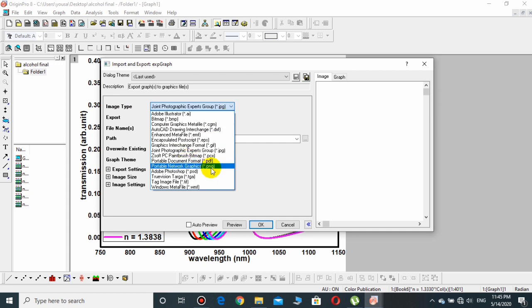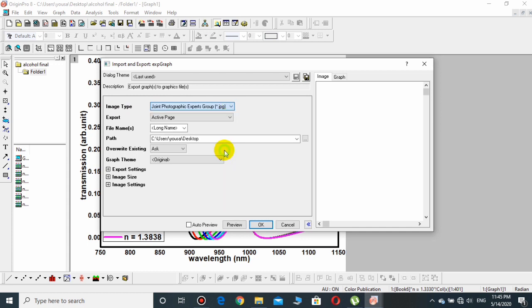Just click over PNG and then go to Path. I have given the path of desktop so that I could show it when it is completed. Then go to some other options as well.